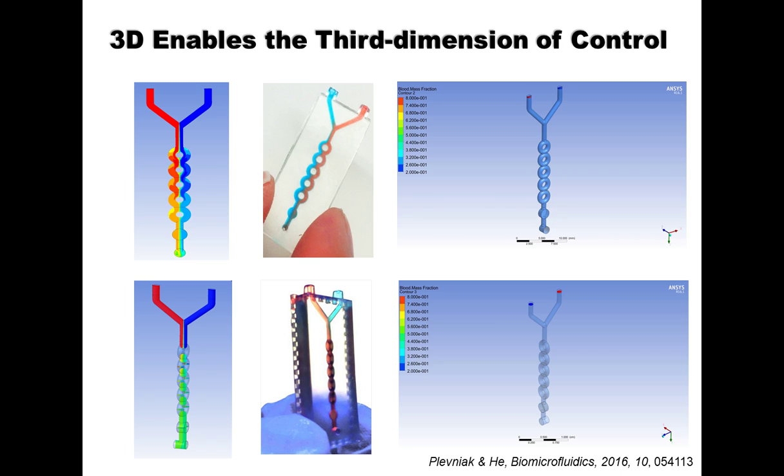So as we simulate exactly, because there's no change in the third dimension of the depth, the two flows mix and still keep the interface, and won't be able to generate any turbulence in the microfluidic channel. So the mixing cannot happen in such a short time, and it totally depends on the diffusion process.